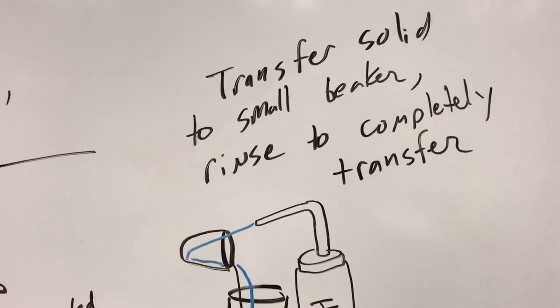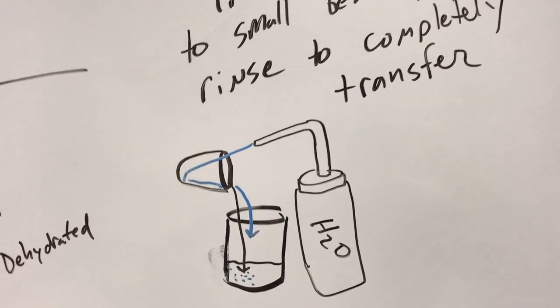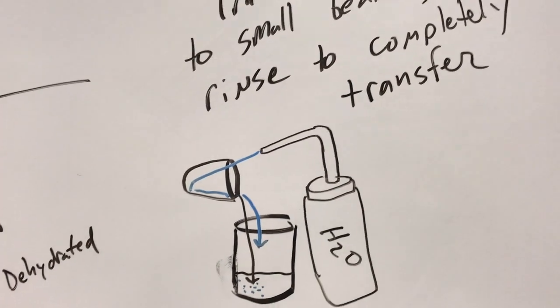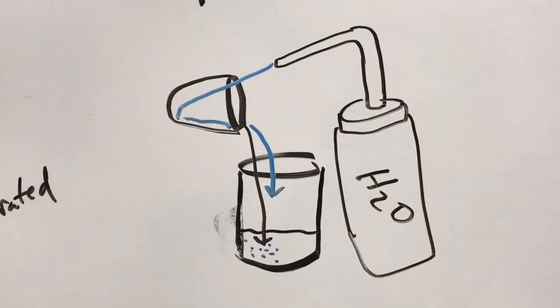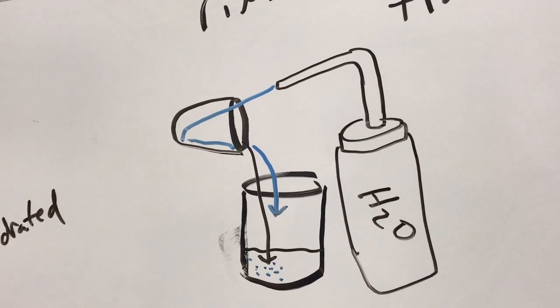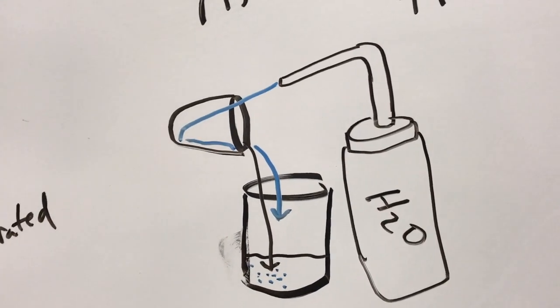Next, we're going to transfer the solid in the crucible into a small 50 milliliter beaker. To make sure that we get all of the solids out of the crucible, we're going to use a wash bottle, and we're just going to spray and wash out the crucible into the beaker. The amount of water here is not that critical. It doesn't have to be a specific amount. You just need to make sure that you get all the solids out as possible.